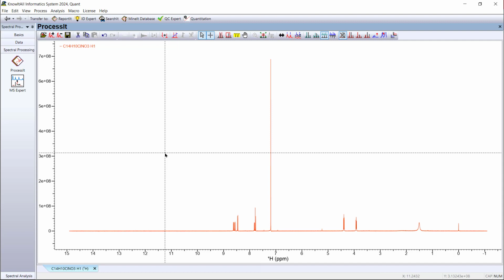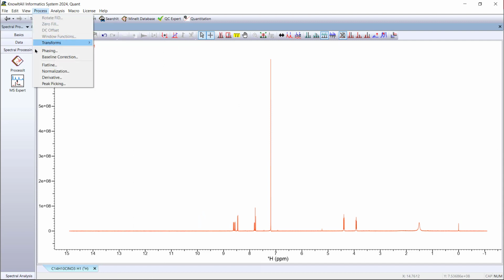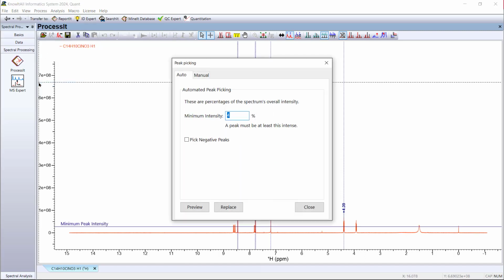This video will review peak picking methods. Go to Process, Peak Picking, to launch the peak picking dialog.